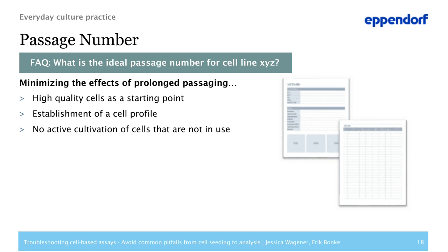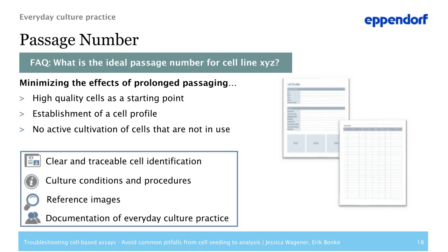In general, keep the passage number as low as possible. You must set a starting point as a reference to obtain reliable results. This starting point should be cells of high quality — ideally obtained from established cell banks, where you get well-documented, authenticated cell lines. A simple measure is to not keep cells in culture that are not actively used for experiments. Don't passage continuously, but rather establish new cells from frozen stocks if required. Establishing a cell profile with all required information is a good measure to keep an eye on unexpected changes that might hint at cellular senescence or over-passaging.